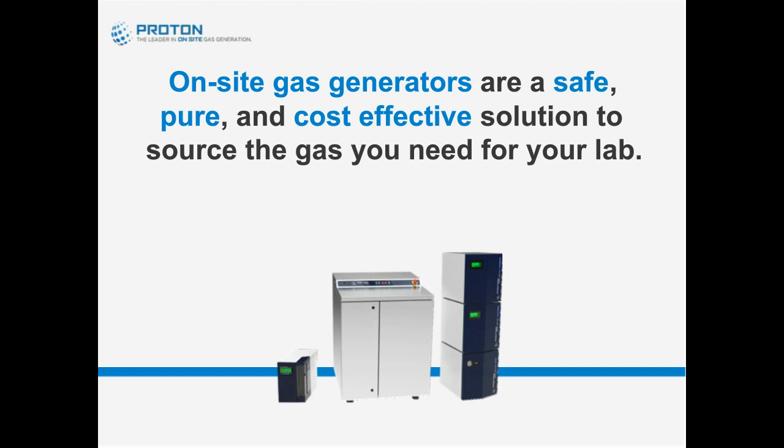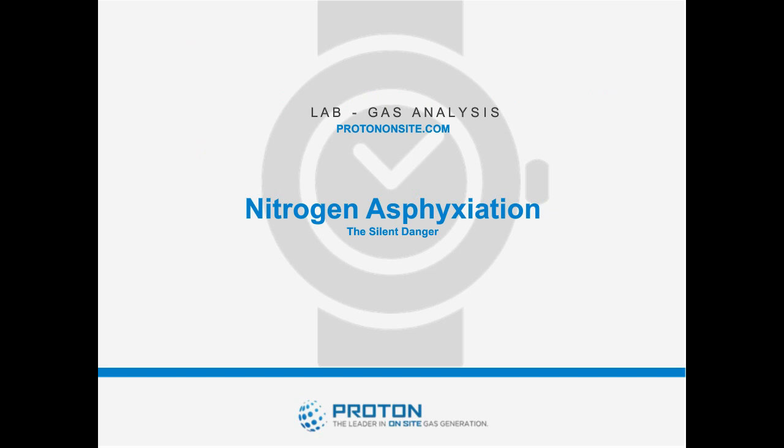The other gas that is critical to most labs involved in analytical chemistry is nitrogen. Although nitrogen is an inert gas that is generally not considered a hazard in small amounts, it carries with it a real risk associated with asphyxiation.